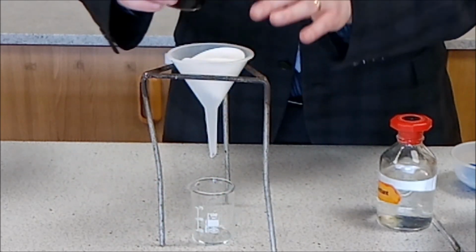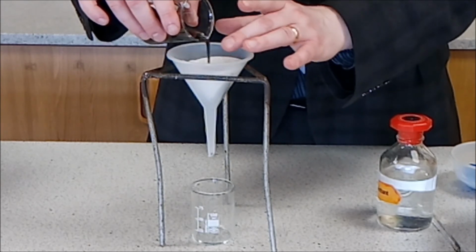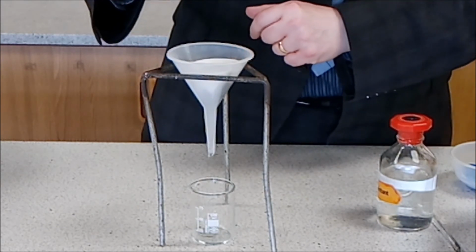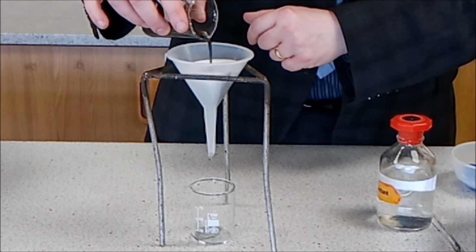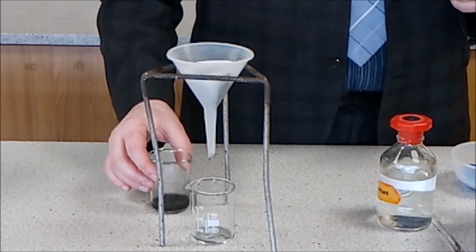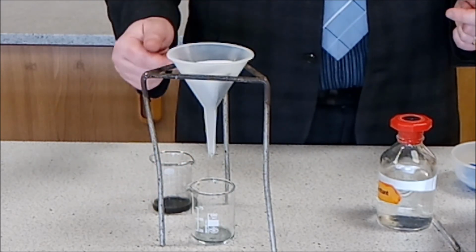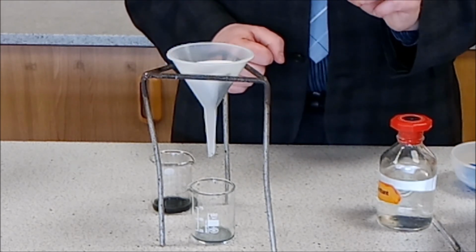And we're then going to filter this, making sure that none of it goes around the outside of our filter paper. And that will drip through until we have a reasonable amount of copper sulphate formed.